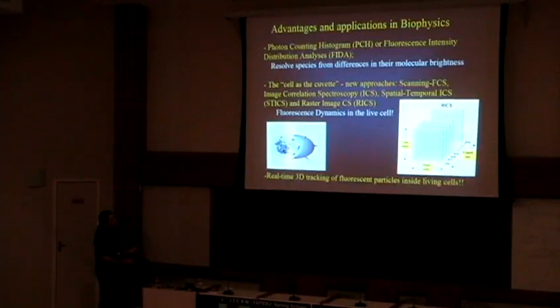So we can try to relate, for example, fluctuations of the same pixel in different frames, so we'll have a time interval of seconds. Relate correlation between neighbor pixels, we have a time correlation of microseconds, and it goes on. So we can have dynamic information for the whole image, and if we are able to do the experiment well, for the whole cell.